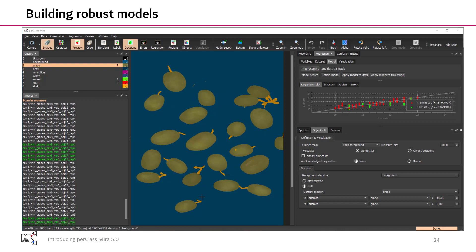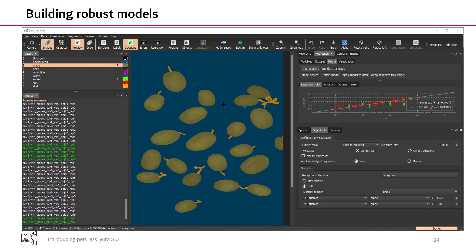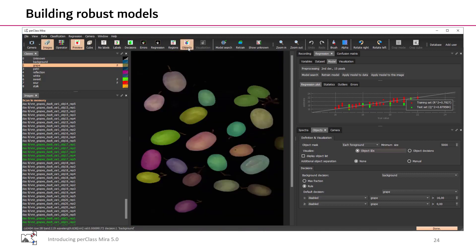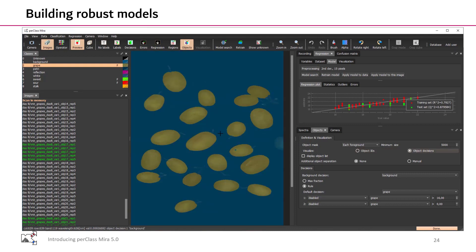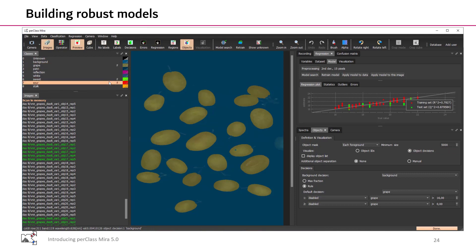In PerClass Mira 5, we extend the regression modeling further into per object decisions. Here I have an example scan with different grapes and I have already built my regression model. These are per pixel decisions. If I switch to object view, we have per object segmentation. We can switch this into per object decisions that in our situation would be all grape. But in PerClass Mira 5, we can add two additional decisions, sweet and sour.